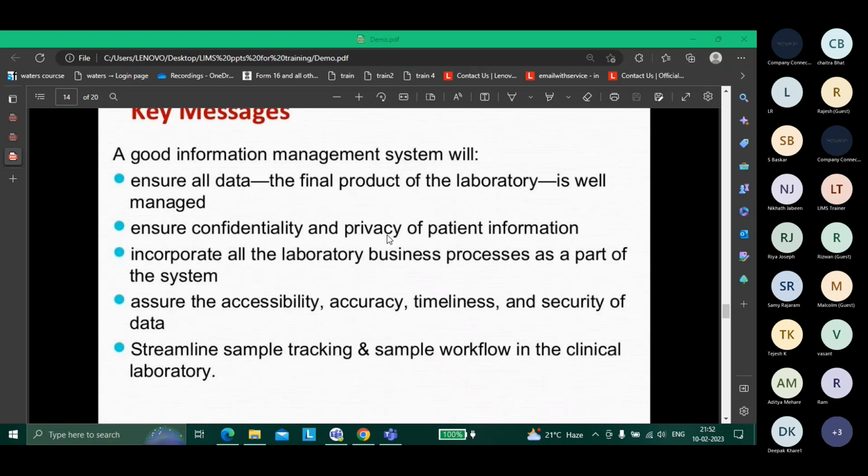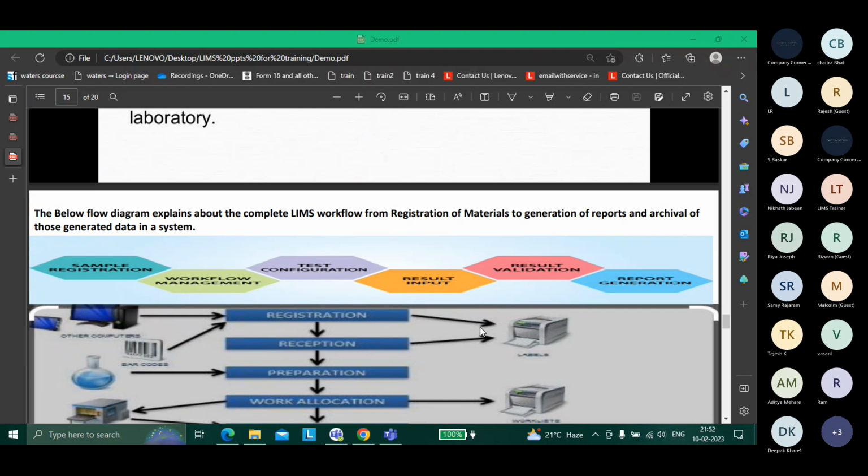Also, that is like protecting the data, that the data is in its place and it's not being changed. Even if it's being changed, it's recorded, or LIMS is recording continuously at the back end who logged in when and who changed it. Or whenever you change it, it'll ask you for a justification. What is the justification? You type the justification. So everything is caught. Everything is within the radar.